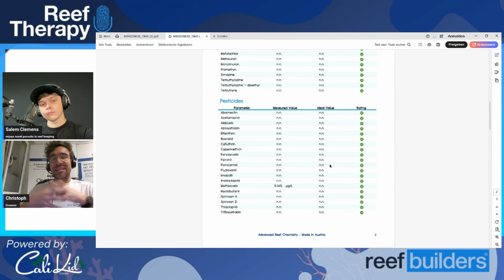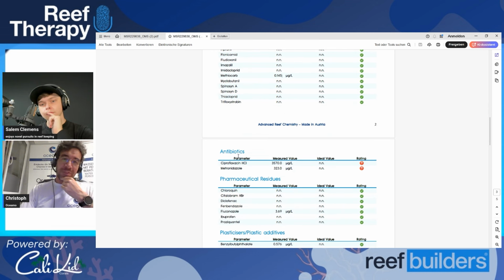The most likely source in my eyes, if it's not from the skimmer and from the air, like somebody spraying or using this around you, is that it's in food products, because fish feeds usually consist of some plants as well, and you don't know where those plants are coming from, and you don't know if any pesticides have been used in production of these plants. And even if there's a little bit in there, we're still finding it, because most of those are really sensitive to measure. Interesting.